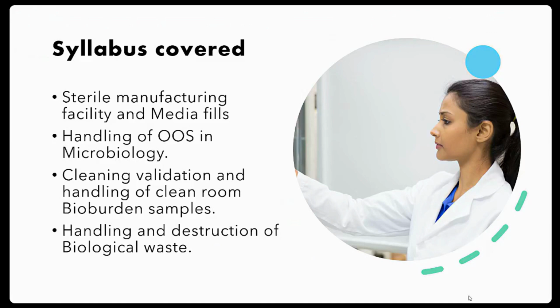Next, handling of OOS in the microbiology. OOS is out of specification. If our sample crosses our predefined specification, then we have to initiate an OOS investigation. If microbiology samples got OOS, what precautions to be taken to avoid the reoccurrence, how the OOS will be handled, we will discuss in this chapter.